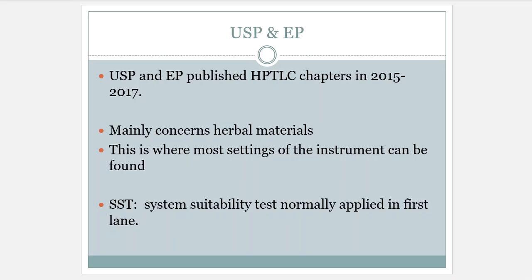So the monographs are constantly getting updated. The HPTLC technology is now part of the back of the USP-NF, for instance, that we've been working out of in our CTC 115 course, if you've taken that. And that's great because, again, it's more technology. It's more instrumentation.